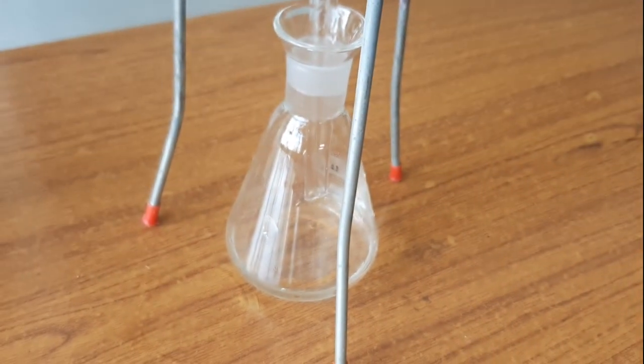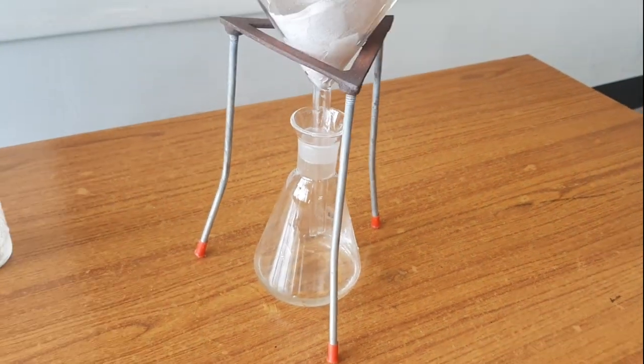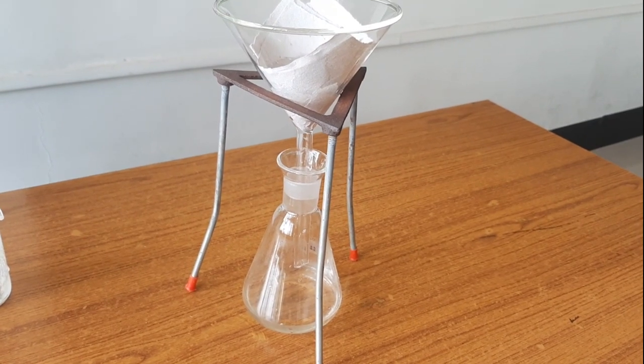Now our filtration has almost completed. We are also checking the time.